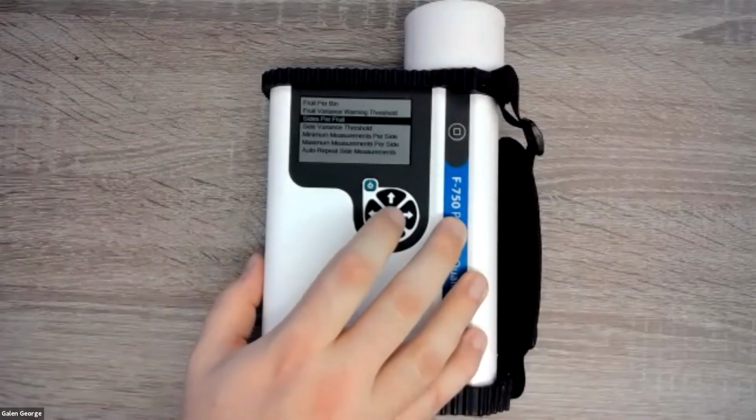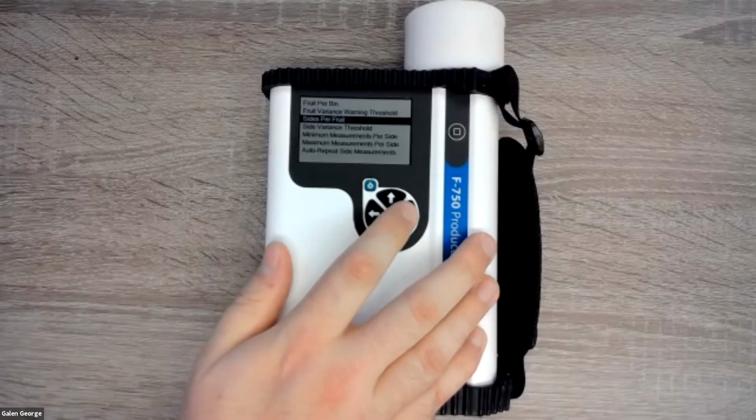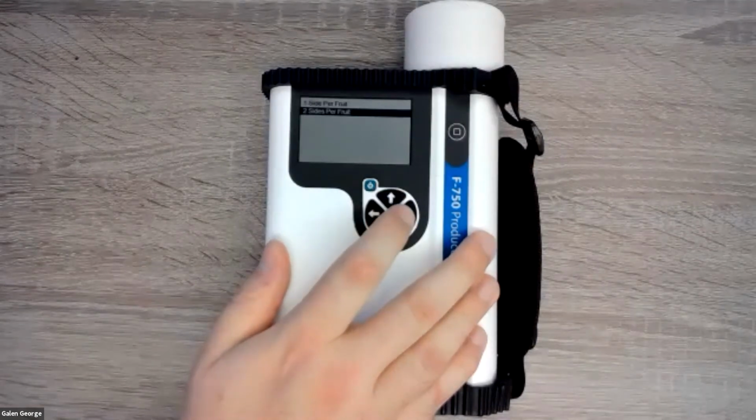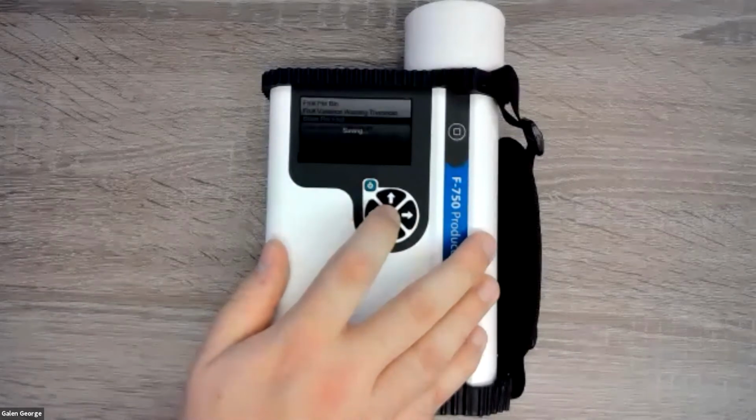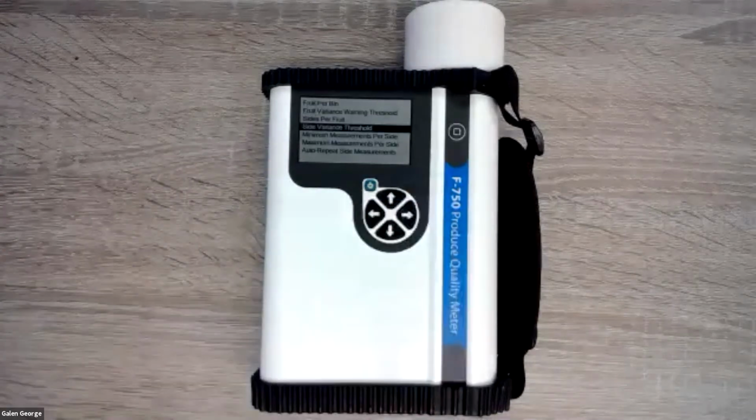So going even farther into that, the sides per fruit. If I only wanted to scan one side of a fruit, that is possible. You can change it between 1 and 2 sides. Right now it's set default to 2 sides. We recommend doing 2 sides for avocado. But if for some reason you only wanted to do 1, that is possible. Same with the variance threshold for the sides.